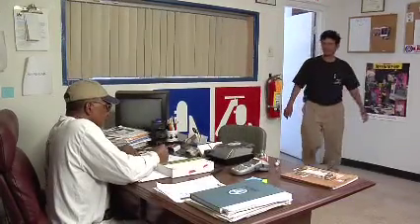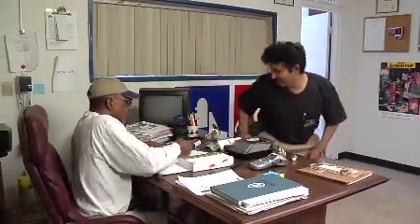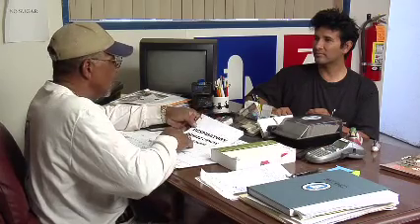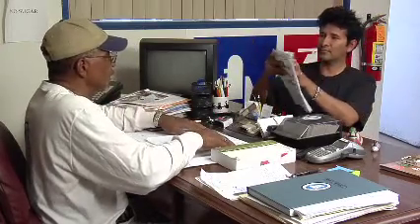While recent fit testing can follow you from job to job, it is still your current employer's responsibility to ensure that the fit testing and record-keeping requirements of OSHA's respiratory protection standard have been met before you use a respirator for protection against hazardous exposures at work.